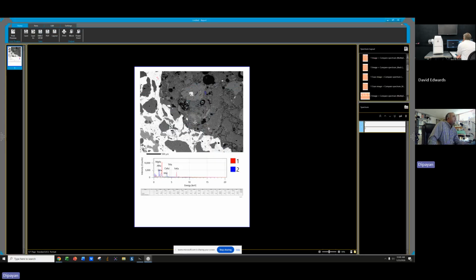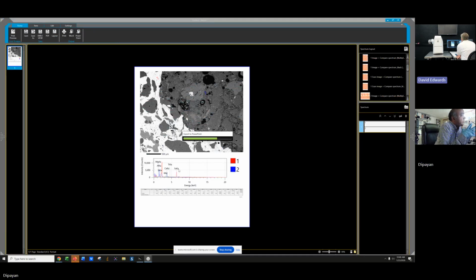So if I get rid of this whole thing, not here. In here, I can't get rid of it. You can't make it go in the template. You can remove it from the PowerPoint afterwards. That's what I mean, in the PowerPoint, because this spectrum is basically an average of everything. It's not a particular element. So although it is giving me both points in color coded form. Right, but why would you do that here?